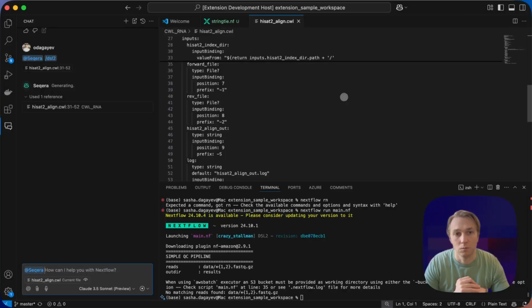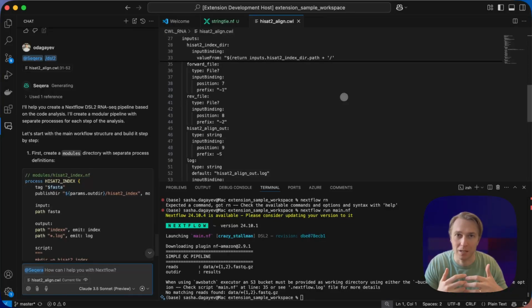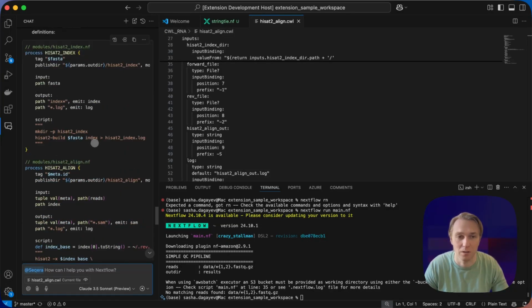And so now we wait, and the model is going to do its thing. The main reason, again, to use our solution and our built-in workflows is that these are really optimized towards helping you get to exactly where you're going with the context of your entire code base, in a way that makes sense for the Nextflow and bioinformatics world, right?